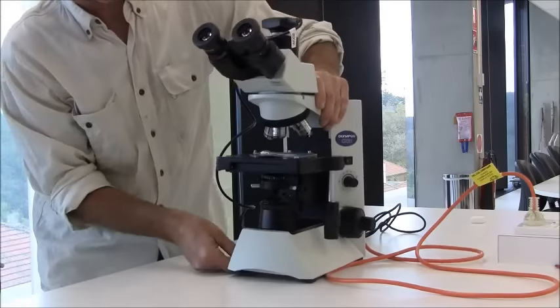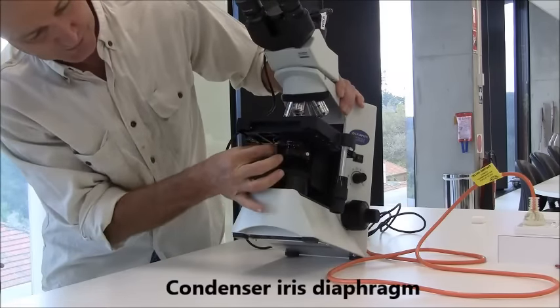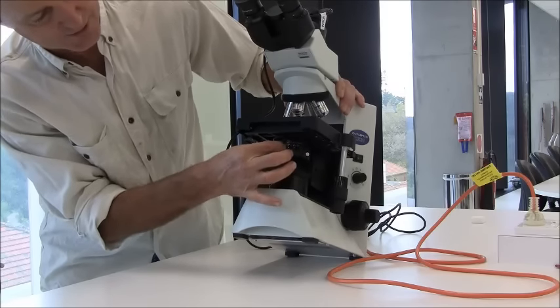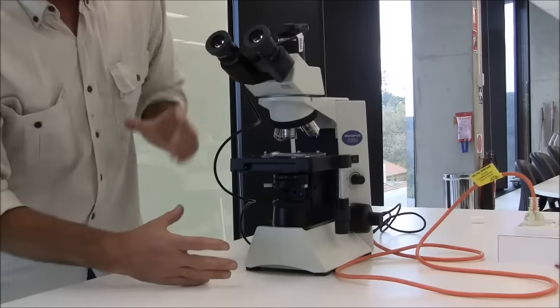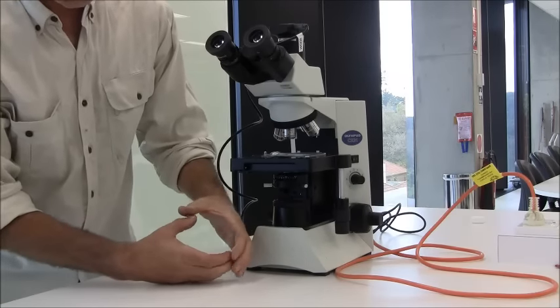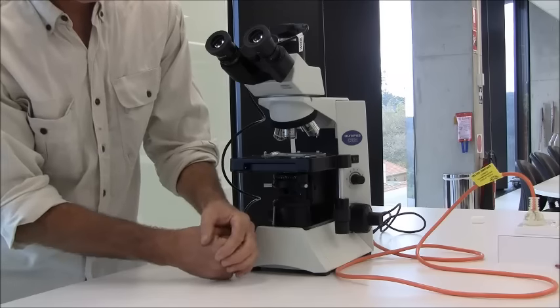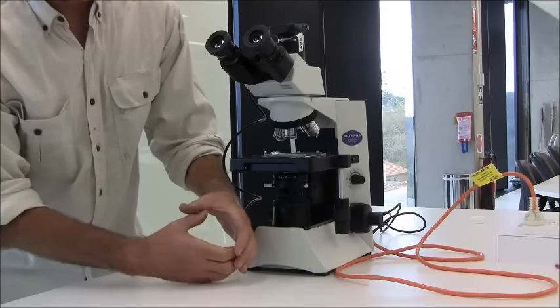On the condenser itself is another iris diaphragm. And that's an important control for varying the amount of light passing through the sample. And it works, if you're familiar with cameras, by constricting or dilating a series of, well, I suppose you'd call them baffles, to allow more light or less light.